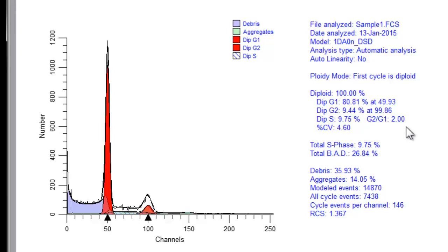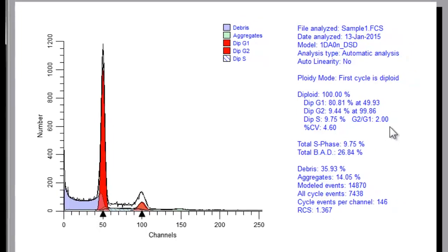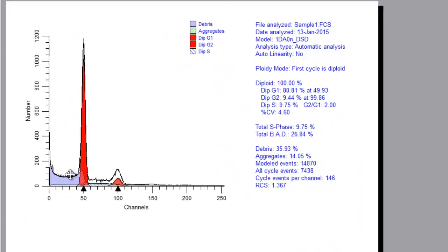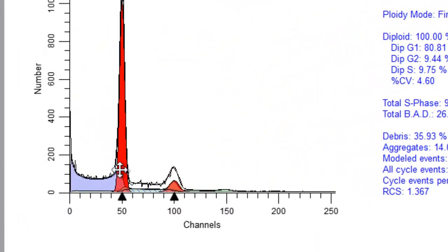Linearity affects cell cycle analysis in several ways. By default, ModFIDLT 4.1 uses the internally stored linearity setting to position the G2M in the fitting process. For example, if a G1 peak is found close to channel 50, the G2M position would be expected to be found close to channel 100 with a linearity setting of 2. If the linearity setting were 1.9, the G2M expected position would be close to channel 95.